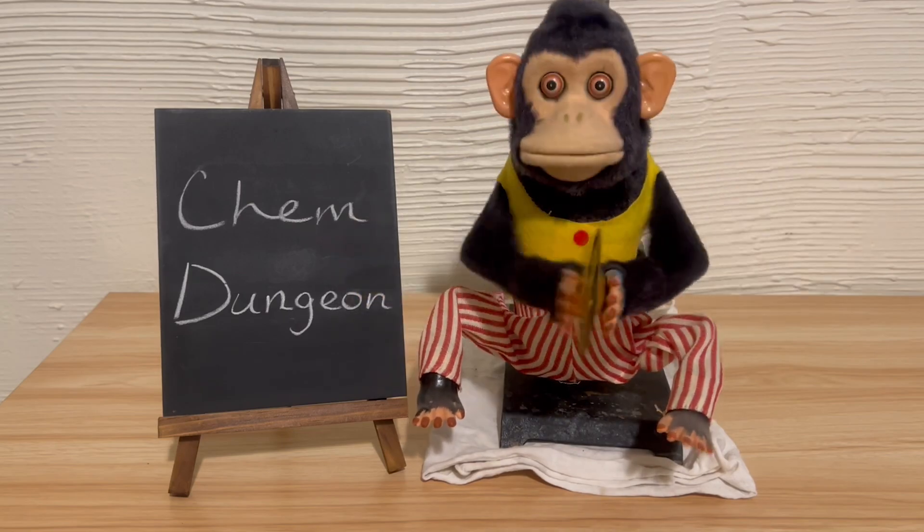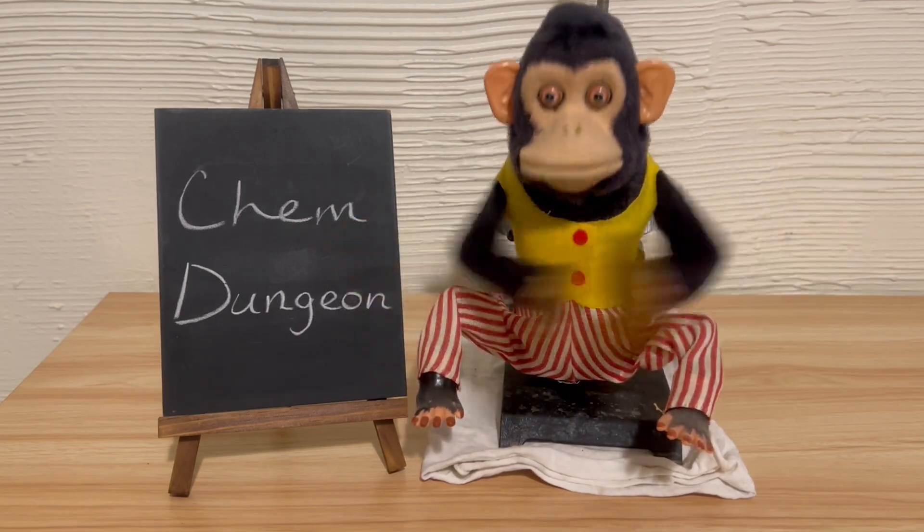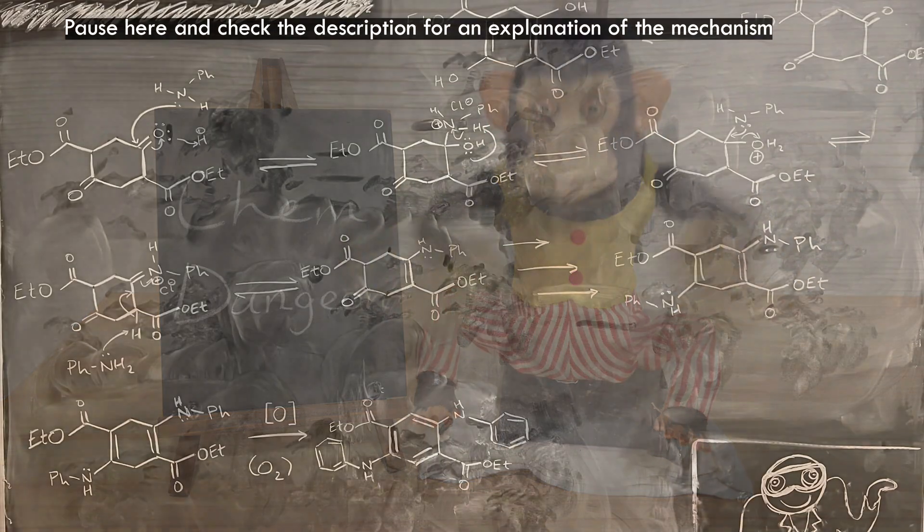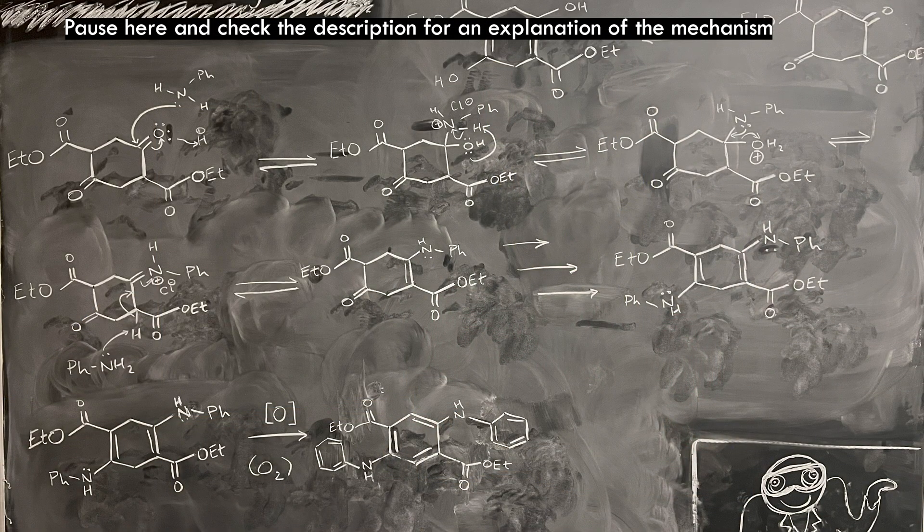In the patent, the reaction is conducted under nitrogen to prevent this oxidation, but I don't have a nitrogen cylinder. The product I end up with can also be cyclized directly to quinacridone easily. In the patent, it's cyclized first, then dehydrogenated or oxidized to quinacridone.